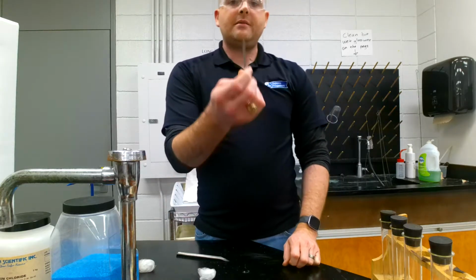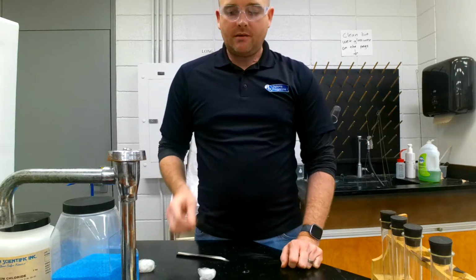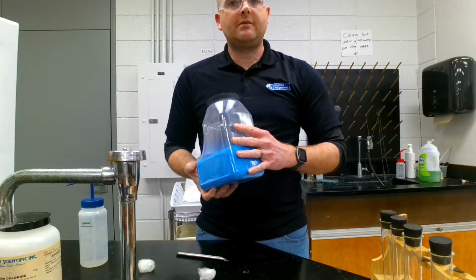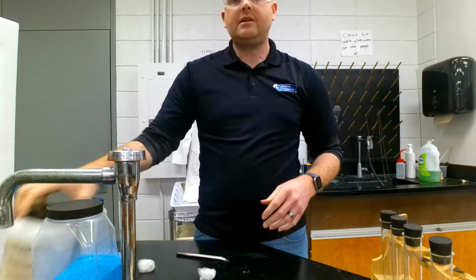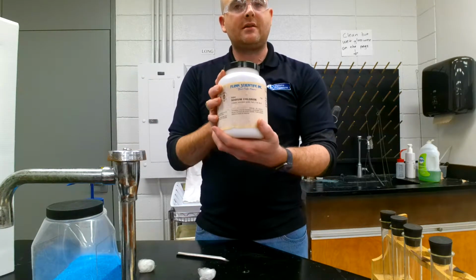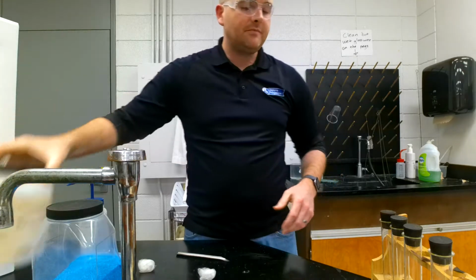So right now I've got my iron, my nail that is iron. I'm going to use some copper sulfate, and then I'm going to use salt. Now remember in our reading, salt is going to be our electrolyte.